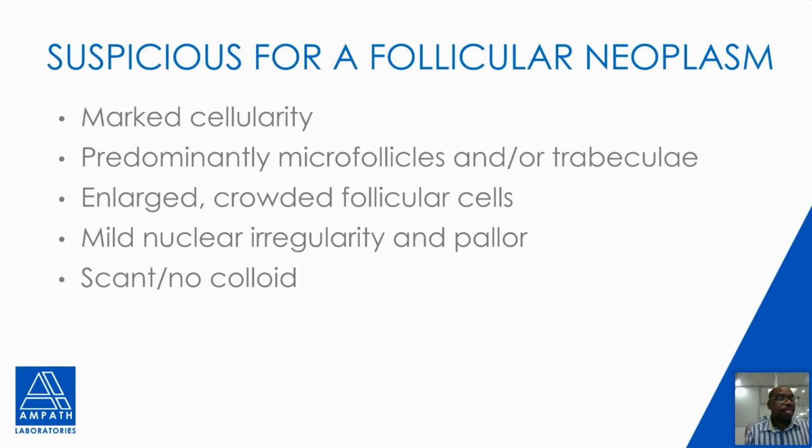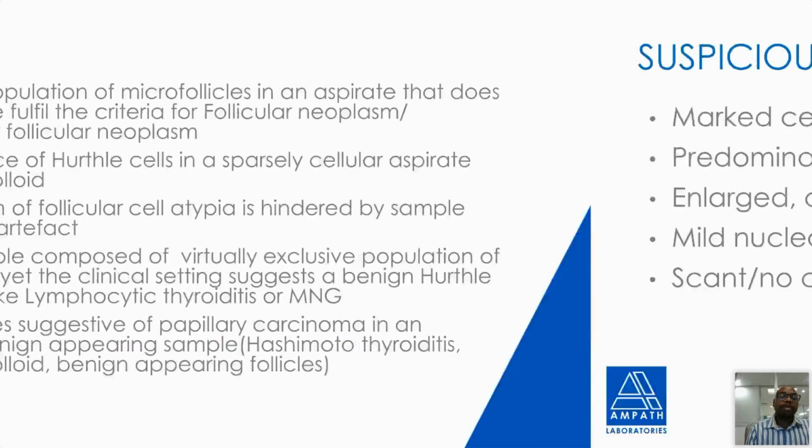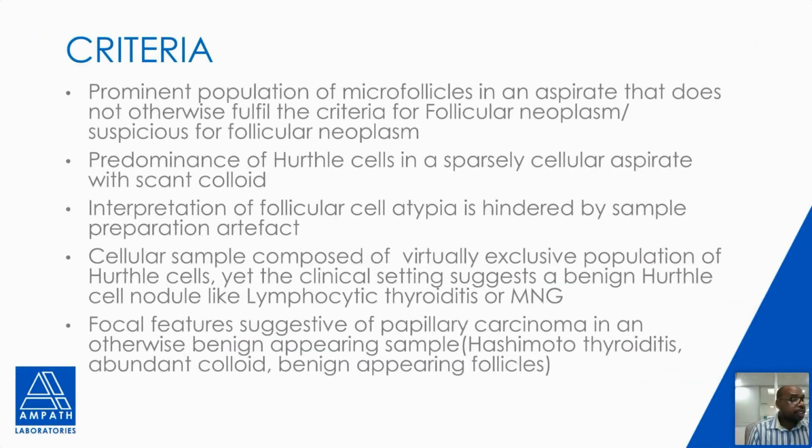And then there are some differentials for that third category. As you can see, you are uncertain when you are making that diagnosis, so it is important to exclude them.